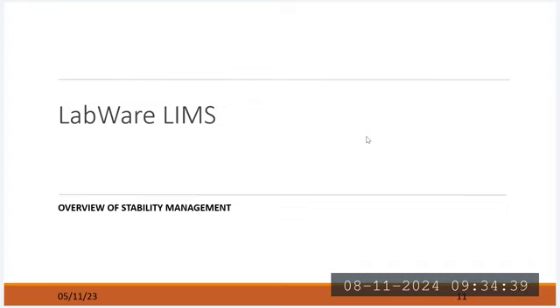Once you log the sample, receive it and perform the analysis, you will be able to get the report also, like the monthly stability sample COA, as well as the last 6 time points, like first month, second month, third month, sixth month, ninth month. With these results I can make one compilation chart as well with the help of Labware LIMS. This is how it is going to be configured and how it is going to work under the real-time application. We will discuss it thoroughly going forward.